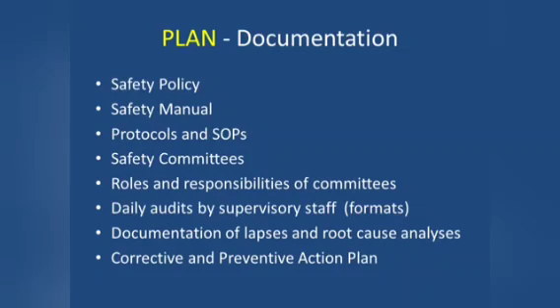Plan. This mainly deals with documentation. After risk assessment and evaluating the lab's premises, you need to put in place a safety policy. Make the policy a statement to include all issues that have been identified. Draft the safety manual. Write up standard operating procedures and protocols and plan formats for documentation.